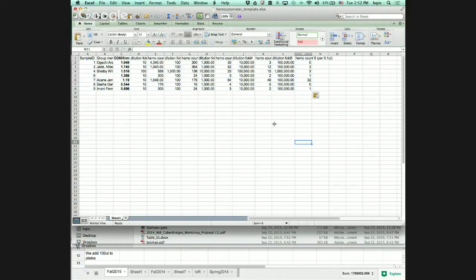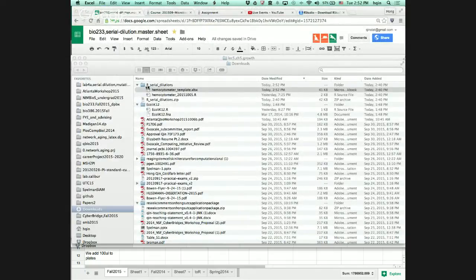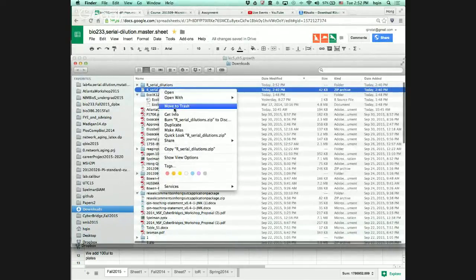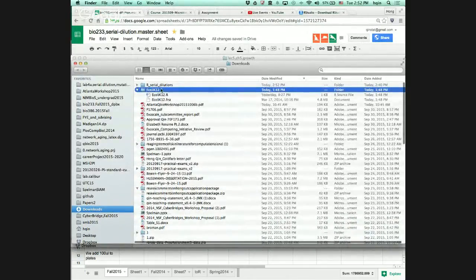Excellent. And just save everything there. And actually, it may be easier. Hold on. Let me make sure this is working, and then I can re-upload.